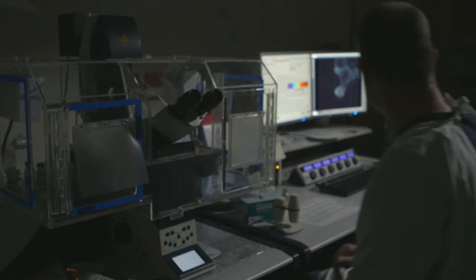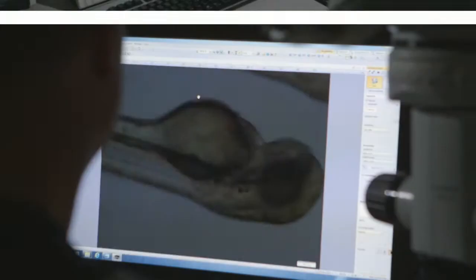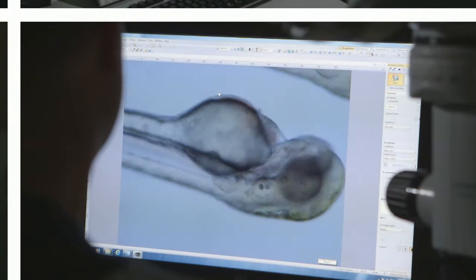Monash Microimaging is an imaging research facility at Clayton campus with nodes at other campuses as well. We specialize in advanced optical microscopy and electron microscopy, which cover a number of different modes from wide-field imaging through to fluorescence and confocal imaging, multi-photon imaging and scanning and transmission electron microscopy.